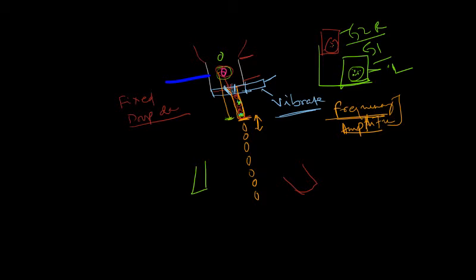As the stream is about to break, the instrument applies a charge. There are electrodes associated with the flow cell, one providing positive charge and the other negative charge, so it can charge and discharge, and apply a further negative charge. In the instrument there are also two voltage plates, maintained at a very high potential difference, somewhere around 10,000 volts. Say this is negative and this is positive, a positive plate and a negative plate.